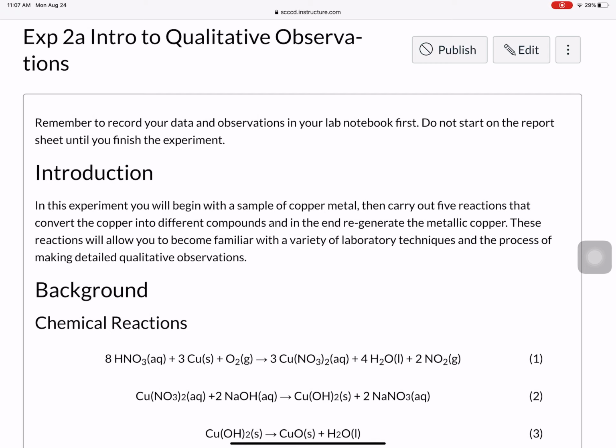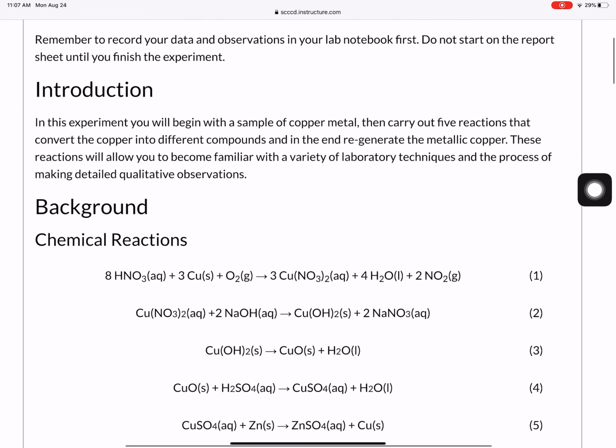Good morning. I just wanted to give you a quick intro video to Experiment 2A, Intro to Qualitative Observations. We'll start here at the top. Remember to record your data and the observations in your lab notebook first. So don't start on the report sheet until you finish the experiment. Then we have the introduction.